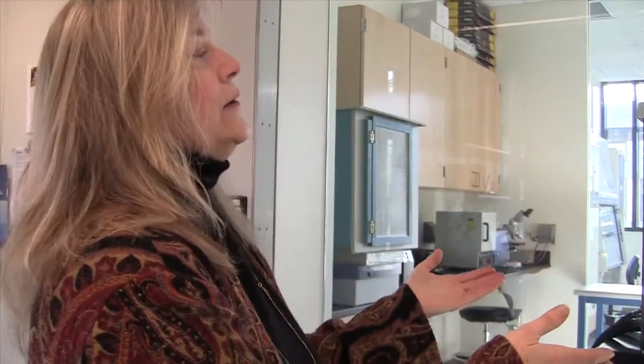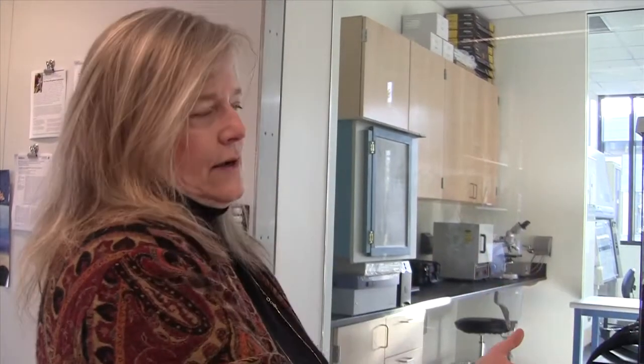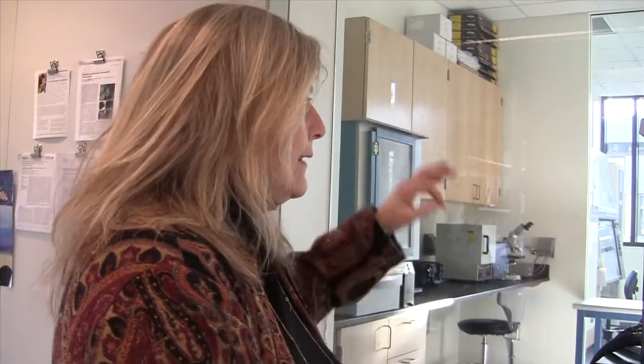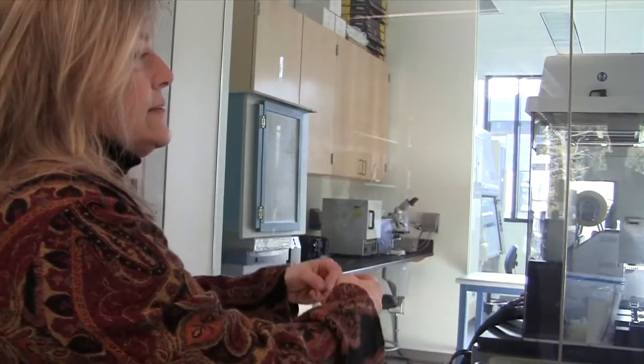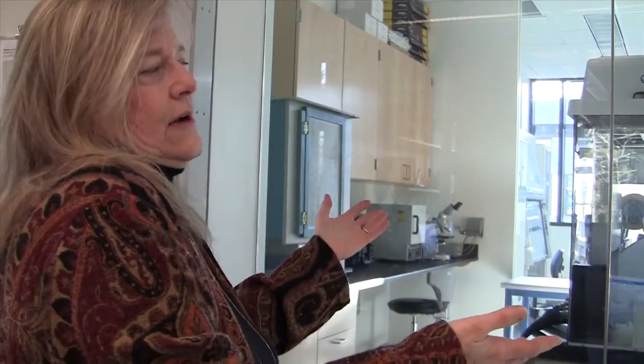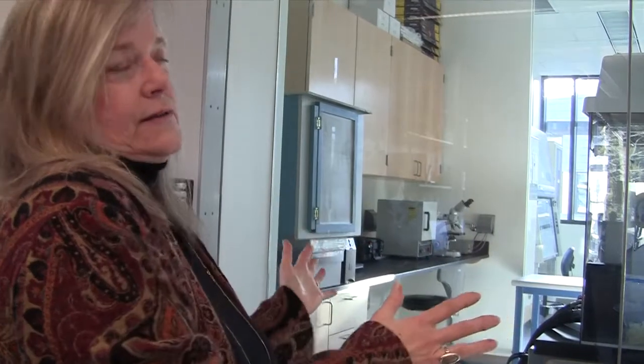This facility has developed and essentially pioneered the way to take the cell out of an environmental sample, not out of a test tube, straight out of the ocean, and we get sent samples from all over the world to do this with. And then, again, using flow cytometry, isolate that cell, get inside its nucleus, get its genetic material, amplify that, and be able to sequence that. So that is the step that we couldn't do before. It opens up the resources of the microbial ocean in a way that's never happened before.